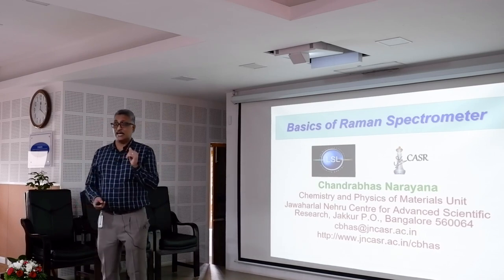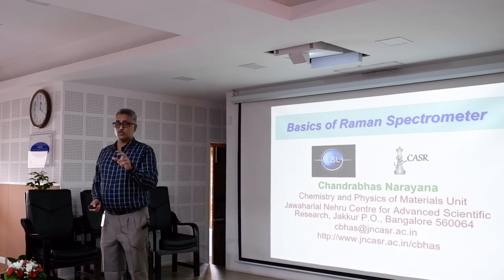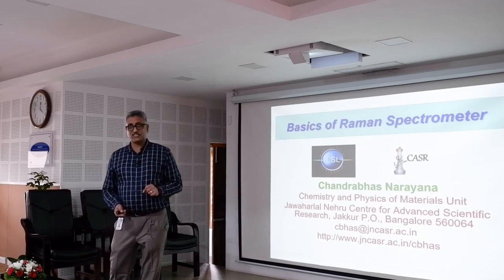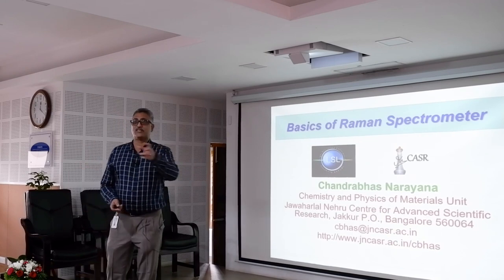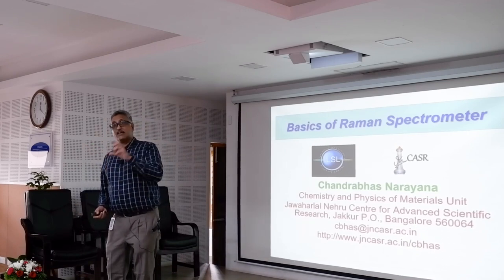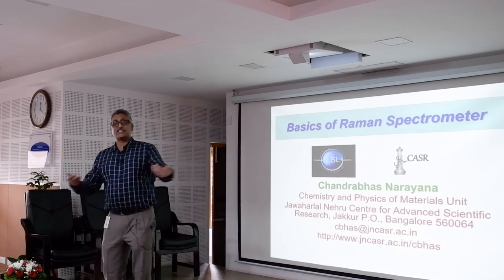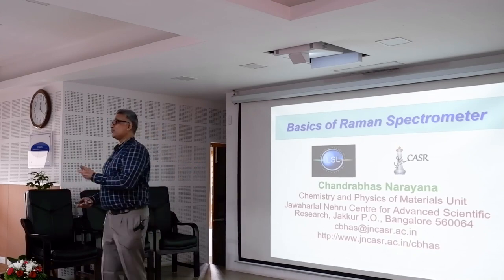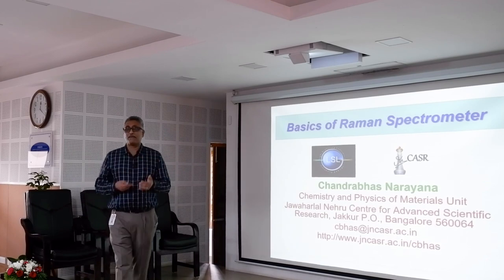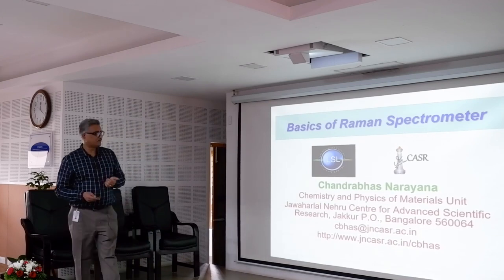And in biology, you can do that, because I can substitute N15, nitrogen 15, an isotope of nitrogen. In the same way, oxygen 18 is an isotope of oxygen, and deuterium can be substituted for hydrogen. You can get isotopically pure amino acids and synthesize your protein with them. Then you can compare the Raman spectra of the wild type and the synthesized one and talk about what is happening in the system. So this is for complicated systems.